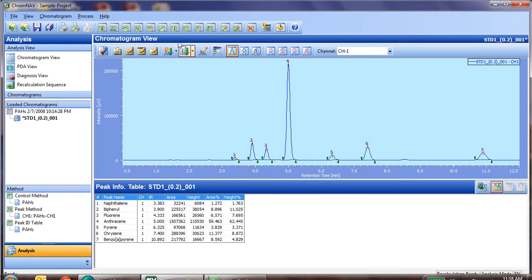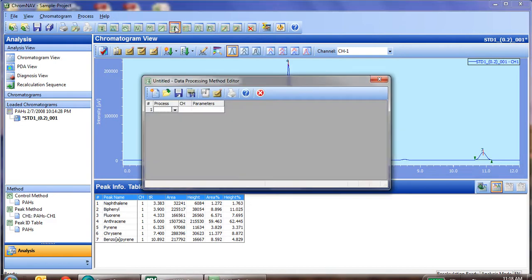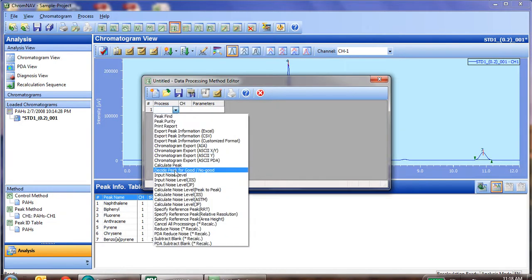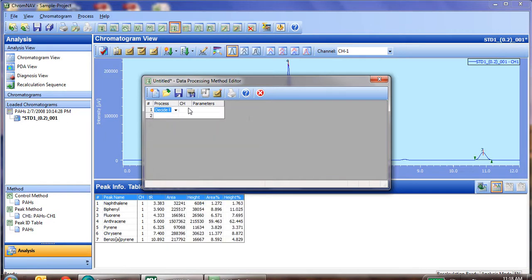To do so, we go to our data processing method, and under the process we select decision peak for good slash no good.